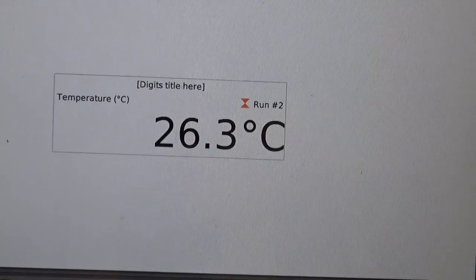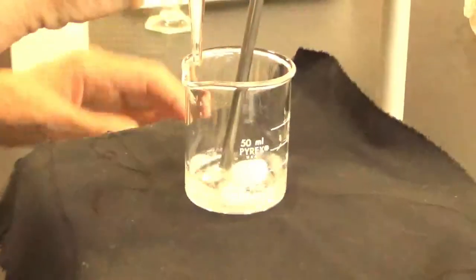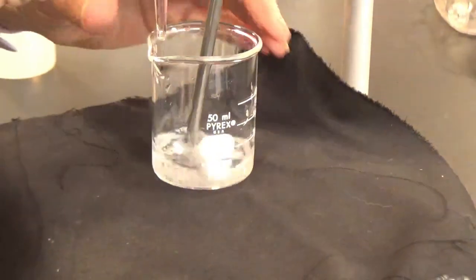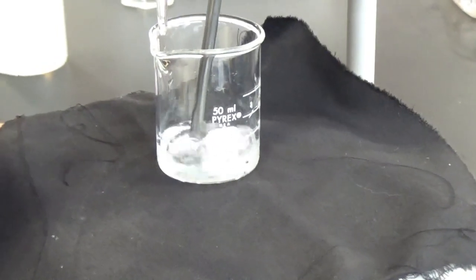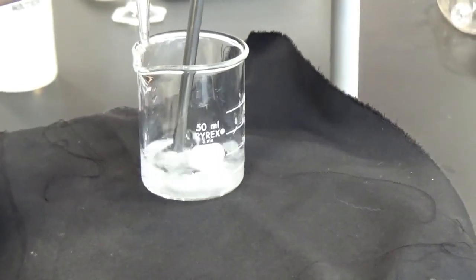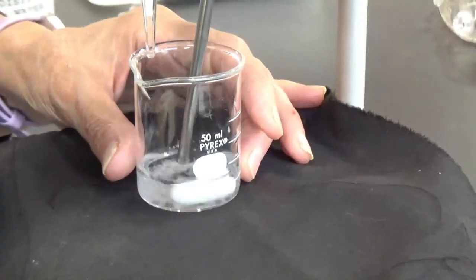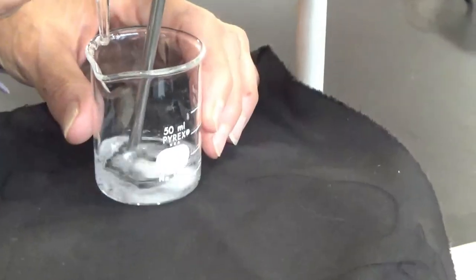When it reaches 27, I think I'll add some more water. If I can wait that long. Maybe I'll put just a few drops. Put something in there. Yeah. Oops. Not that easy to see, I gotta tell you. Well, I can't even tell, it's so close to the edge. Yeah, I see drops. But there's plenty of crystals still in there.